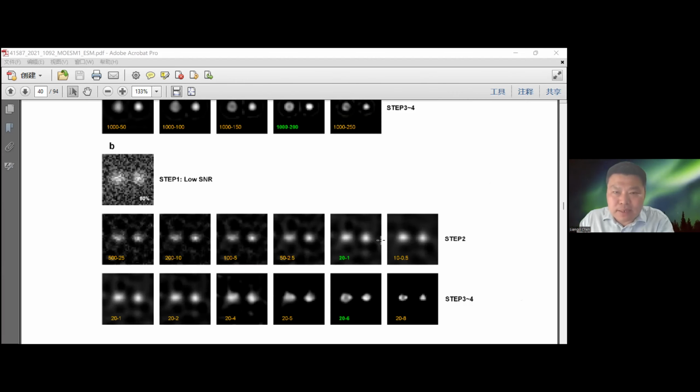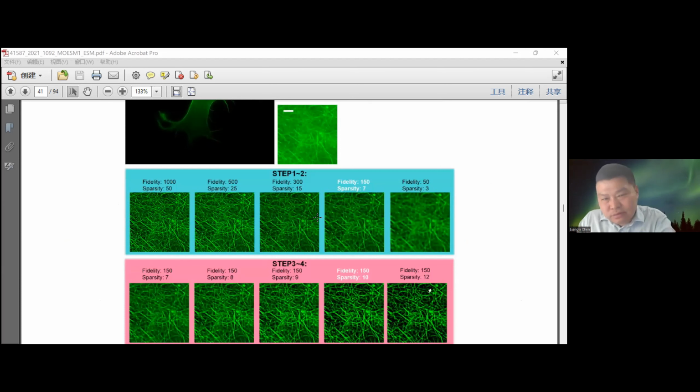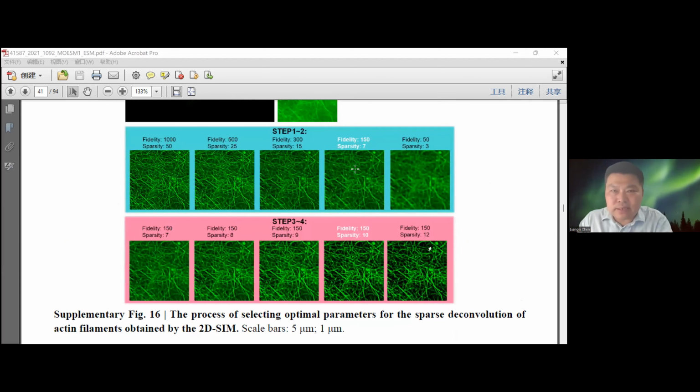But this serves as a good starting point. Then you have to put this up and put that down to see the data. Do you think someone has integrated this into the classical resolution precision formulas? These factors coupled in.